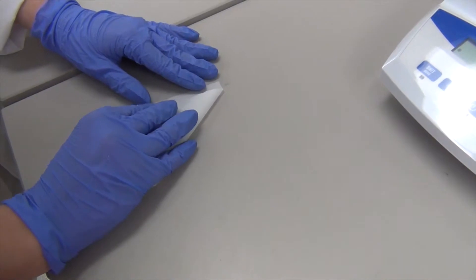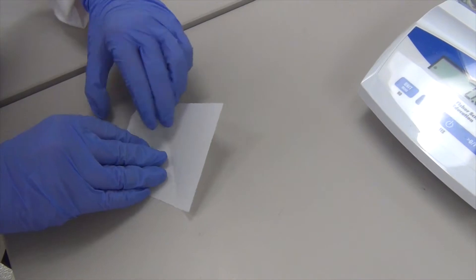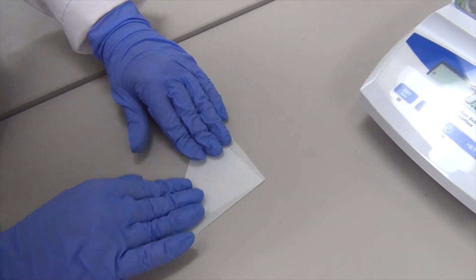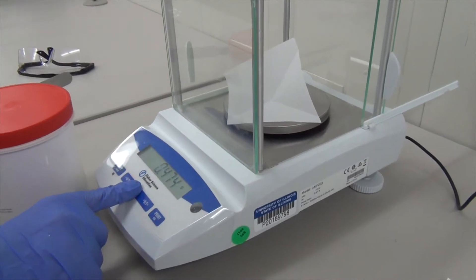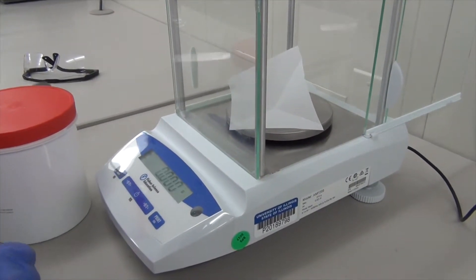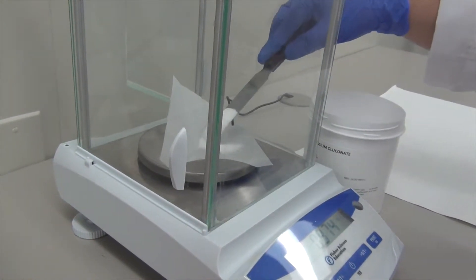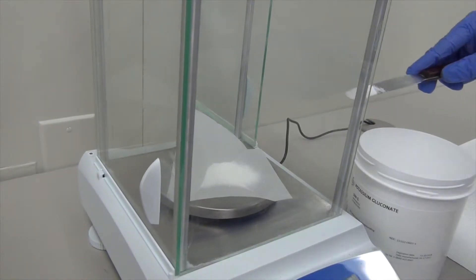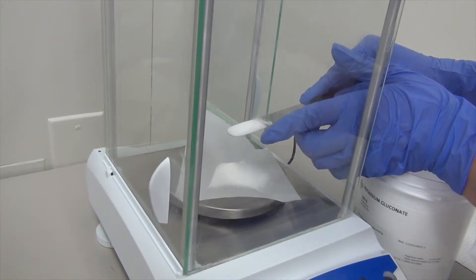For step four, you are going to want to weigh the potassium gluconate. It's a good idea to fold your weighing paper before you add the drug, so that the drug doesn't easily fall out. Make sure you zero your balance with the weighing paper before you add the drug. Begin adding potassium gluconate to the weighing paper until you get the desired amount. When you start narrowing the final weight, you can tap the tip of the spatula to slowly add drug so that you don't overshoot it.